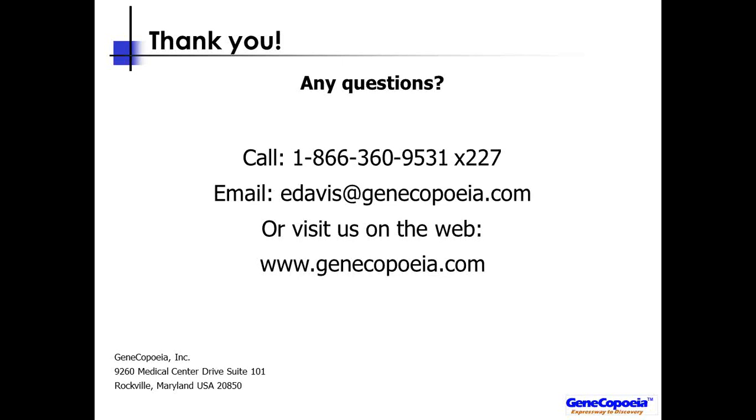Okay, next question is, can I just order individual sgRNAs from your libraries instead of the whole library? The answer is yes. Again, you would just need to call us for a quote. And I see one more question here. Can we get the gene lists that are in the libraries? Yes, you can. Those gene lists are available on our website. You just need to first create an account.